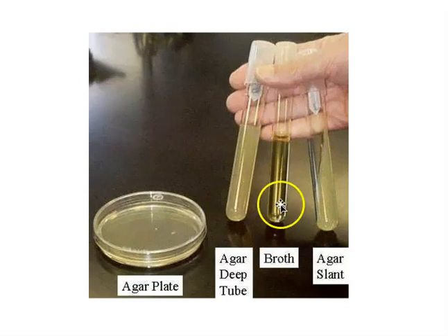The tube in the middle here is just a broth tube. As you can see, the broth is much more transparent than agar is. And finally, on the right-hand side, we have an agar slant. When an agar slant is prepared, the tube is placed on its side while the agar is hardening, so that we end up with this slanted sort of shelf of agar surface for growing bacteria. We can spread cells all along this slanted edge and grow them inside an agar slant.